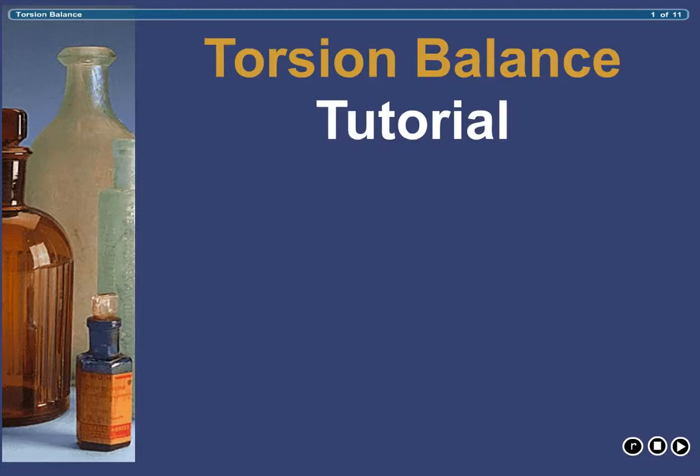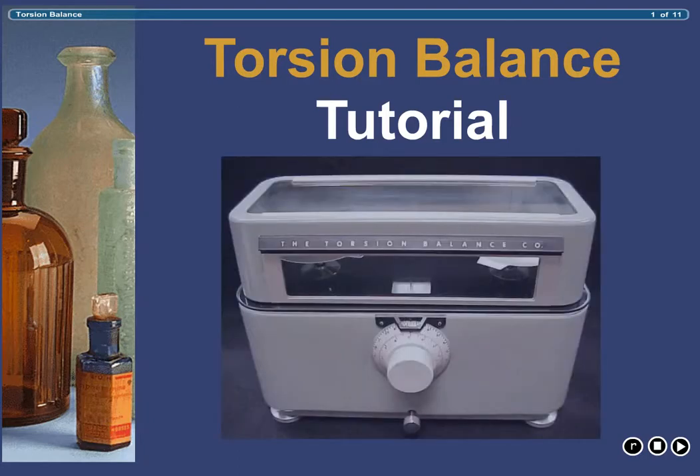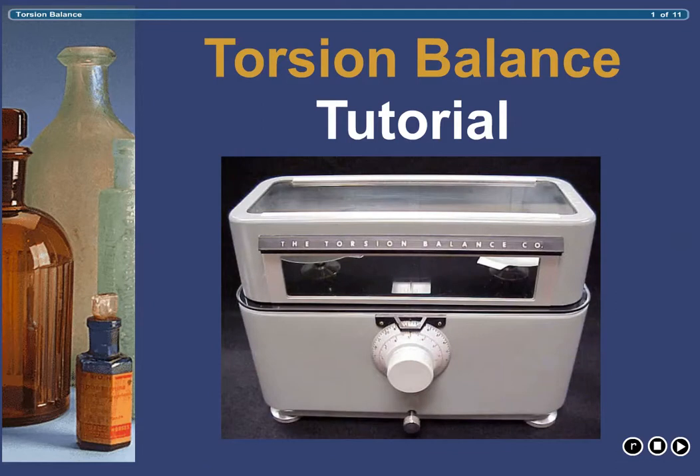Although pharmacies that specialize in compounding and therefore do a lot of weighing often invest in sensitive electronic balances, most pharmacies continue to use a torsion balance for weighing solid materials in daily pharmacy practice. For this reason, it is imperative that each student of pharmacy be well versed on the use of this piece of equipment. This tutorial is designed to introduce you to the various components of the balance as well as the technique used for weighing.